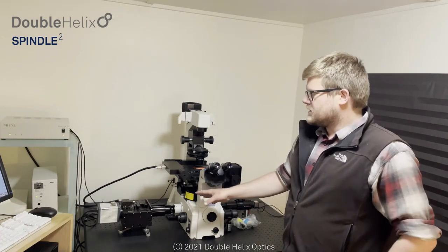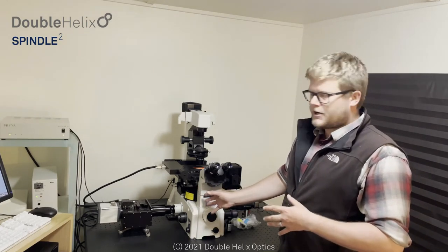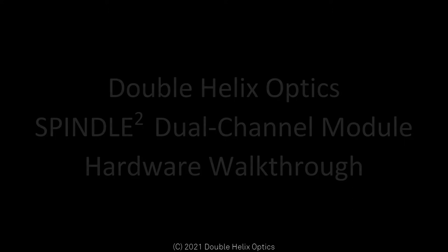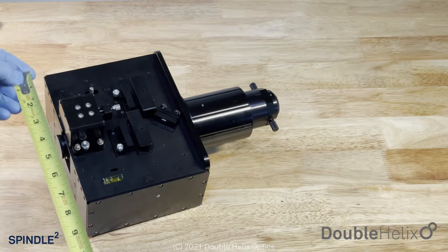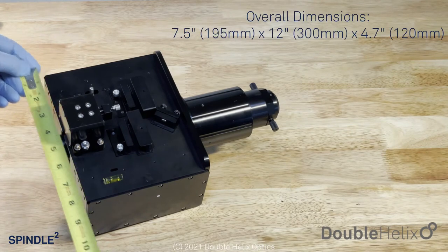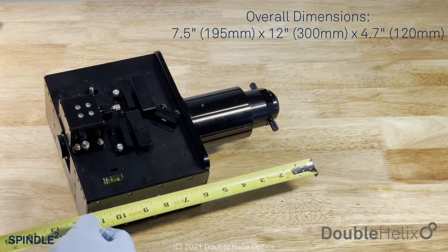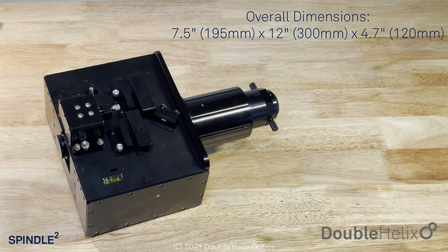Before we get started, we'll walk through the Spindle Squared hardware in detail off the microscope body. Here we have our new Spindle Squared product, not mounted on the microscope, currently set up in a two-channel mode. To give you a rough idea of size, we're looking at about seven and a half inches wide, the main body is about six inches long, and in this extended mode, about 12 inches of total length before the camera.